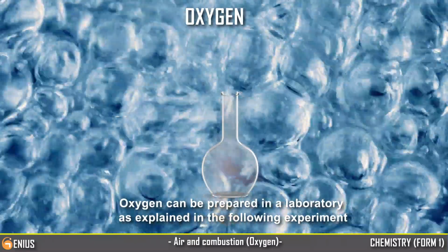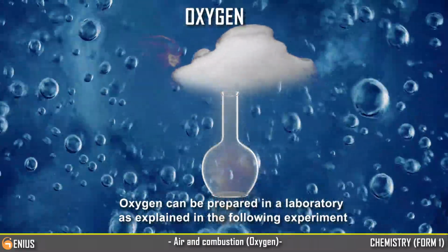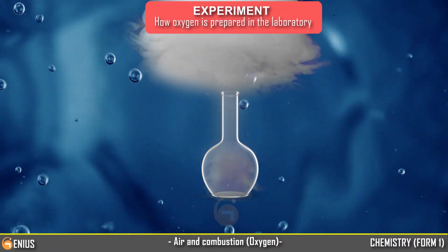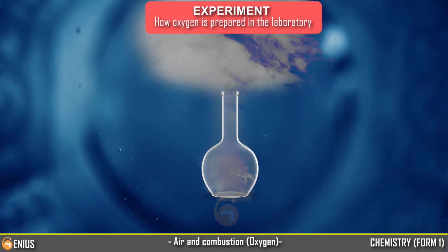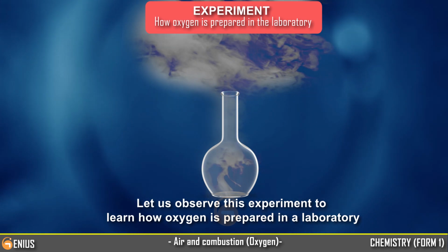Oxygen can be prepared in a laboratory as explained in the following experiment. Experiment: how oxygen is prepared in a laboratory. Let us observe this experiment to learn how oxygen is prepared in a laboratory.